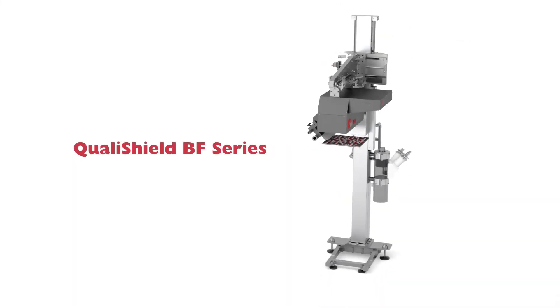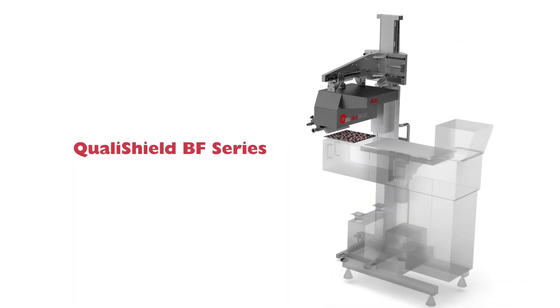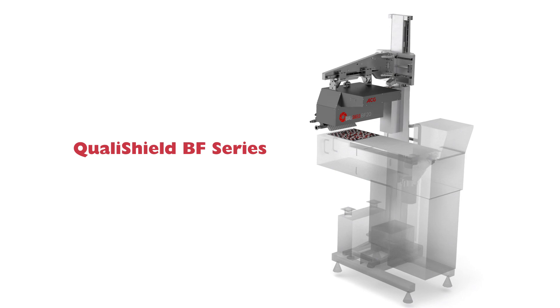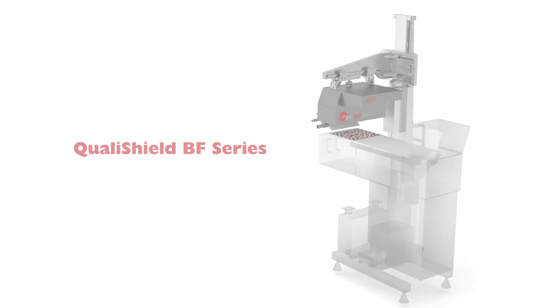Ensure flawless inspection with QualiShield BF Series. ACG. Make it better.